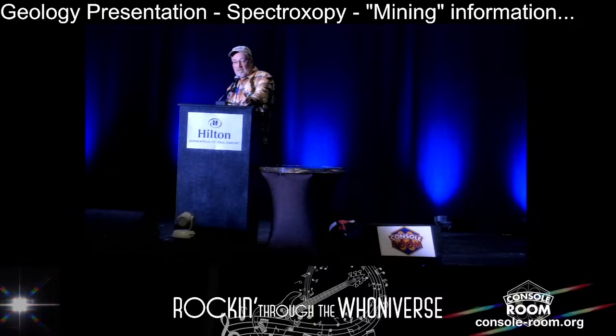One of the micrometeorites had a little metal bleb in it, and it was the first time I had seen iridium in a spectrum. And iridium, we know, is the iridium layer that is related to the Chicxulub crater. But there was also rhenium and osmium in that particular little metal bleb. Is it an alloy? Is it a new mineral? We don't know.